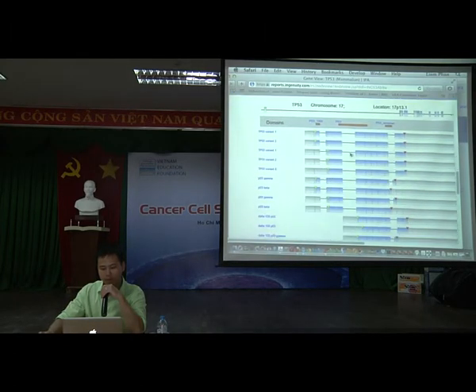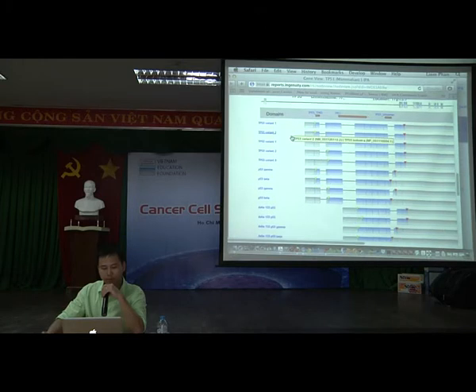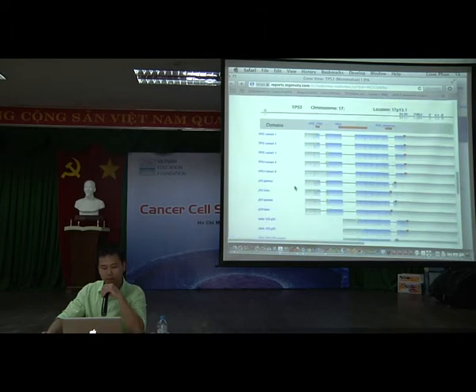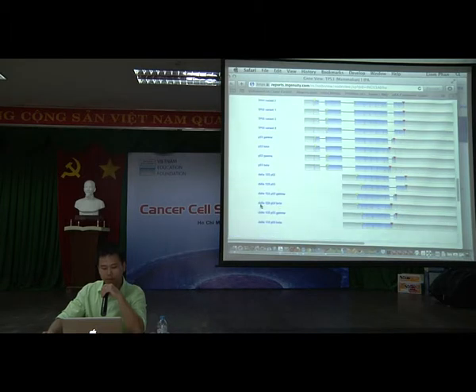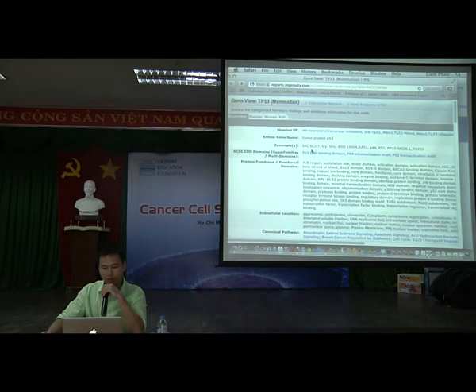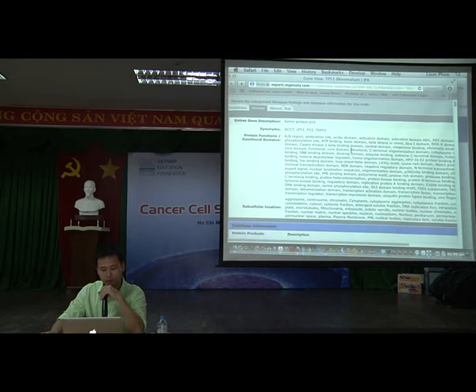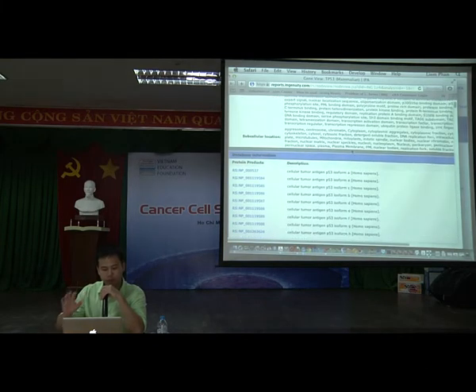This is the domain of p53. You can see it has multiple variants. This is the domain of p53, the location. And this is other variants of p53 like delta p53, gamma, beta, etc. Okay. And if we want to study human p53, just click human. And again, you're going to see a similar description, but more focused on human.